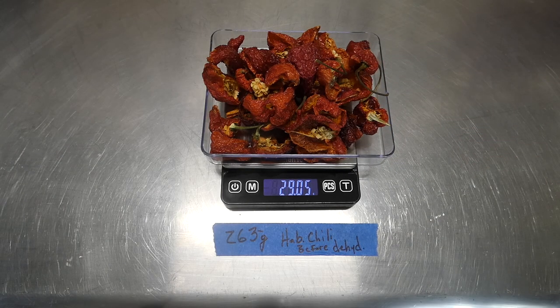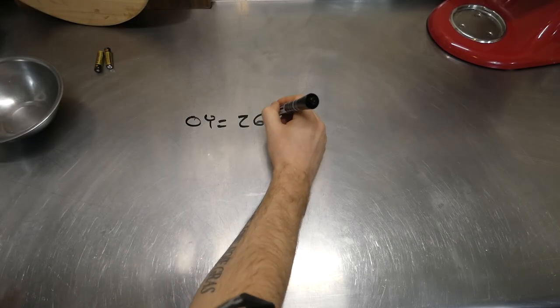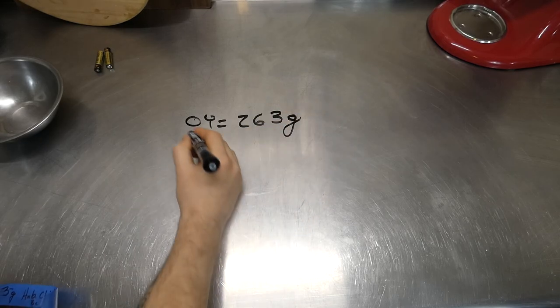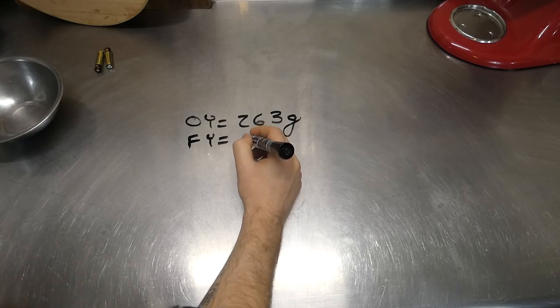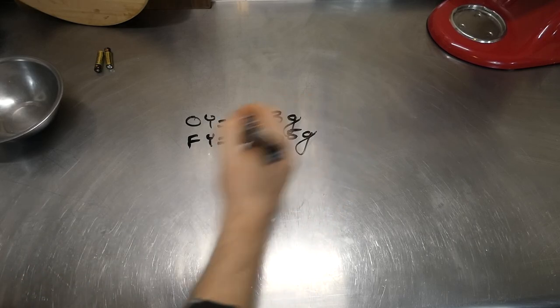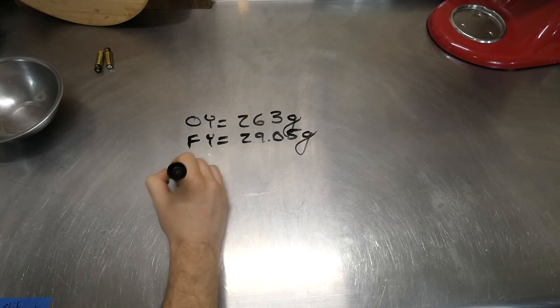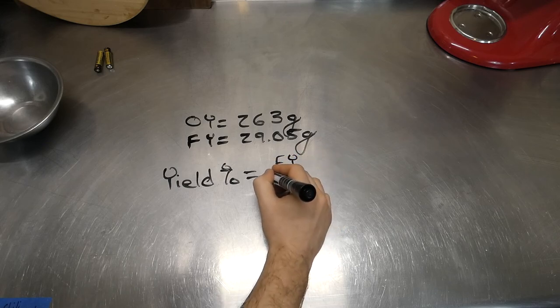And we're left with 29.05 grams. So, big difference from the original weight. Our original yield was 263 grams, and our final yield, after dried, was 29.05 grams.